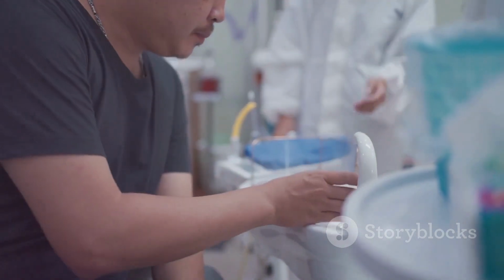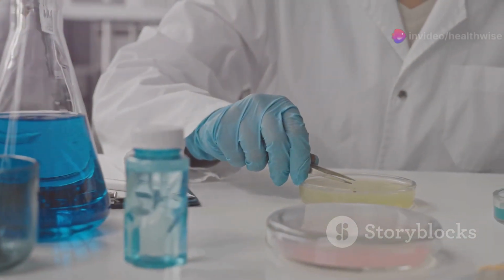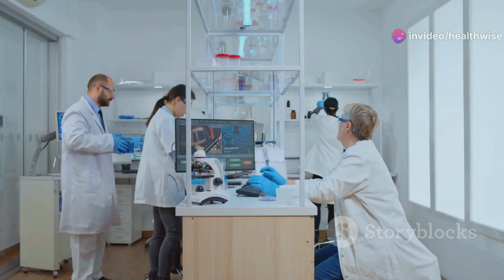Proper usage is just as important as maintenance. Users should follow manufacturer guidelines and avoid overloading the incubator. This ensures that the device can maintain the required conditions effectively.